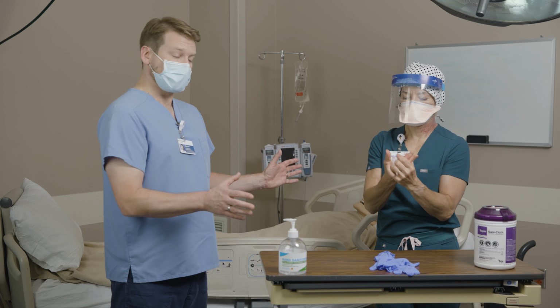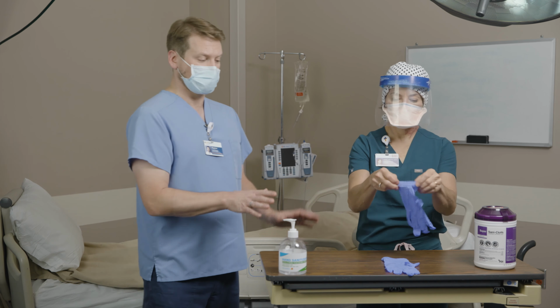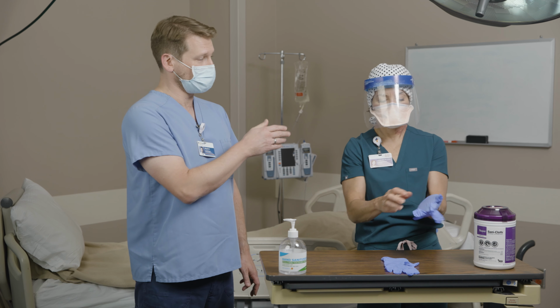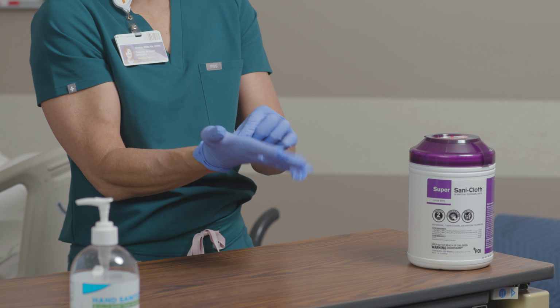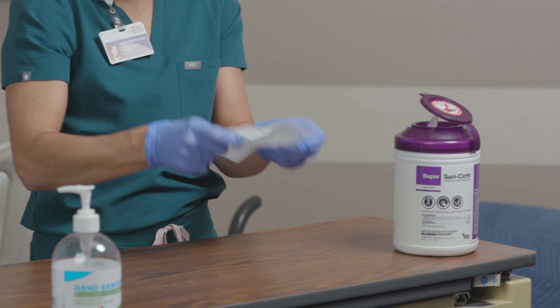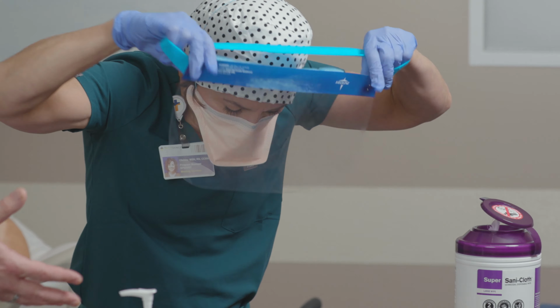So the setting now is Krista will have exited the patient room. She will proceed to the designated area for taking off her face shield and her respiratory protection. She's going to go ahead and start by donning a new set of gloves because she is going to be handling disinfectant wipes. You can put one wipe down to place the face shield on, just as she did there.